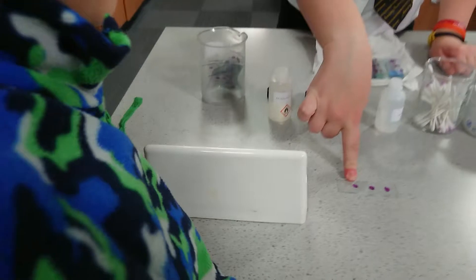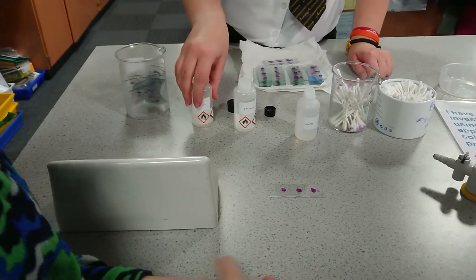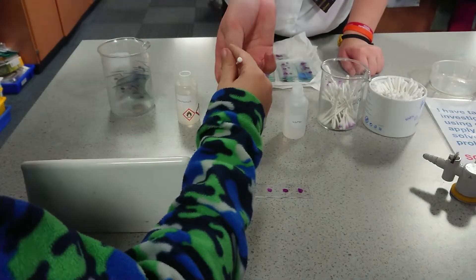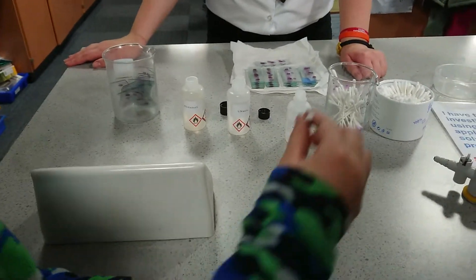We've got three different qualities of nail polish. We've got water, ethanol, and propanol. We're going to get a cotton bud and see which one gets it. We're going to put it in one of these to see if it works to remove the nail polish. We're going to try all three of them first.